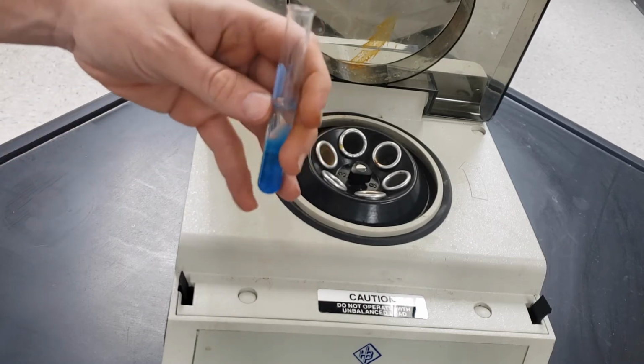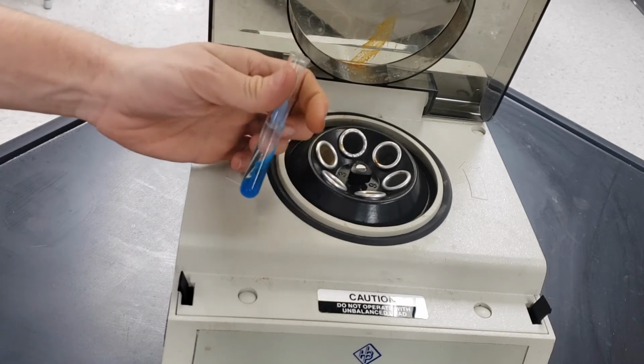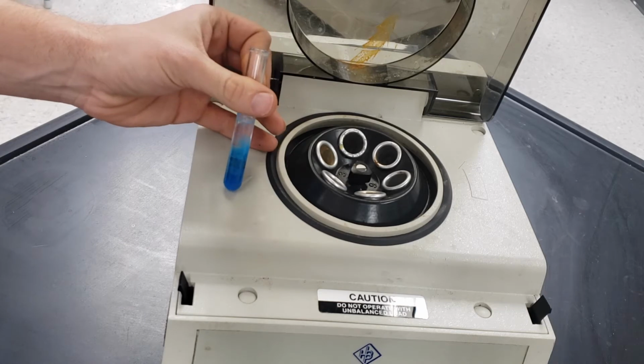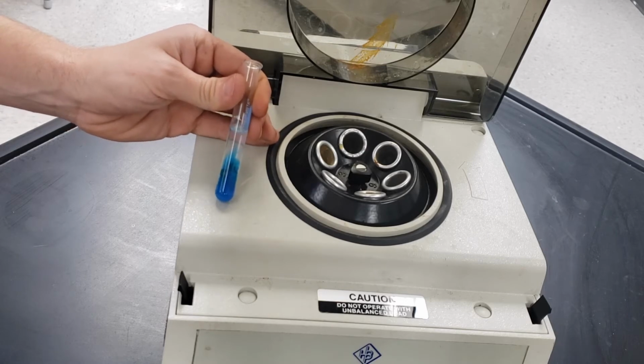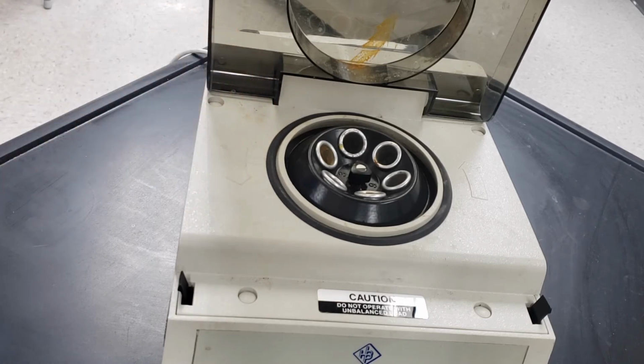And then here is my sample, and you can see, oh wait, look at that. It's completely separated into a clear liquid layer on top, right? And at the bottom is my precipitate. It's definitely a solid. There's no question about it, right? So our prediction was right. Even if it took us a little bit of extra work to prove, here we are. Let's go back to the table.